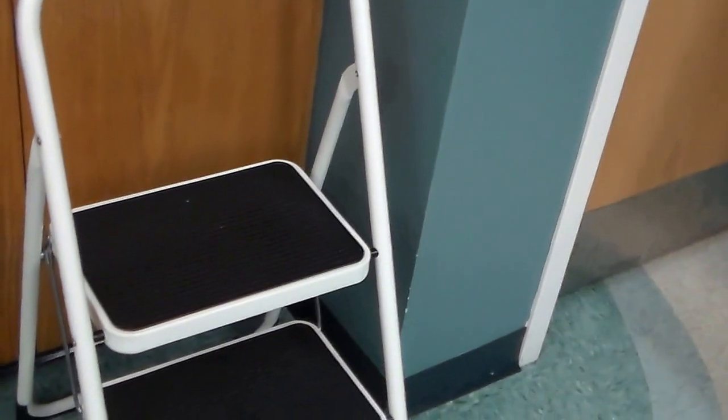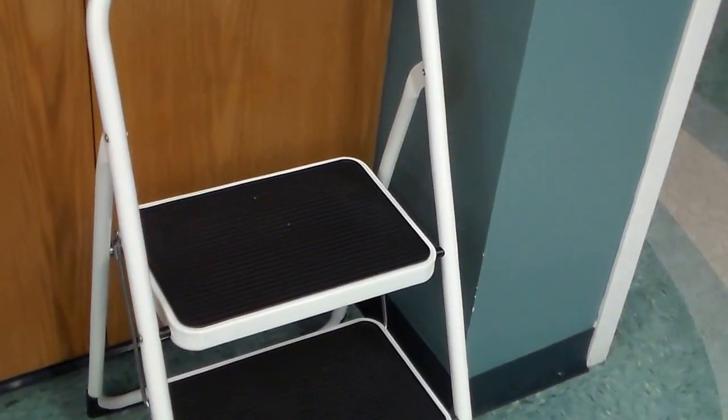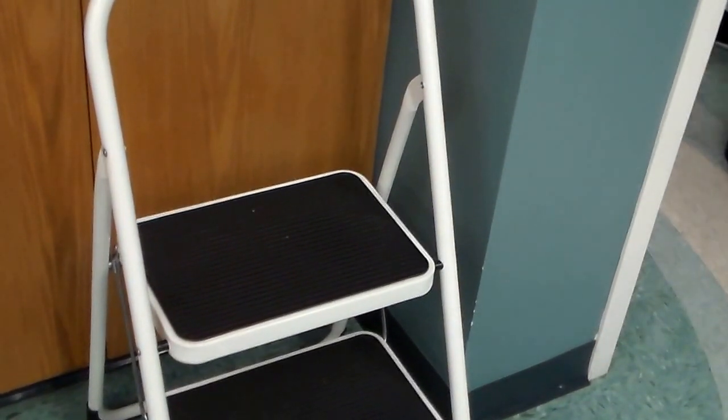Coming around the room from there we have a step stool that is commonly parked over there. Use that whenever you're taking readings from the burette when you have to get up high. Don't stand on your tip toes. You will fall, you will hurt yourself. I've done it and it's not fun.